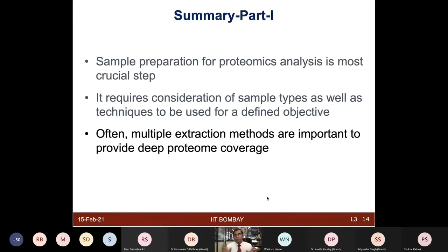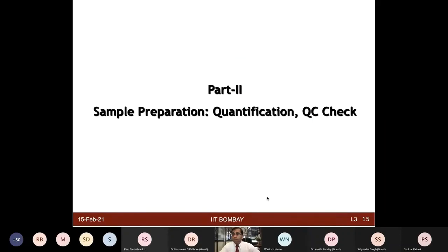So the first part, sample prep, making a good sample, and the third part, data analysis, are the most crucial in the entire proteomics workflow, in my own personal opinion. The middle part looks very gadget oriented and cost oriented, but is actually the simplest part, because if the instrument is good, the facility is good, and the technicians are good, they will generate good quality data irrespective of different projects. But the sample intake has to be really crucial for that matter. So just continuing on the sample prep part, before we go to the more interactive sessions.